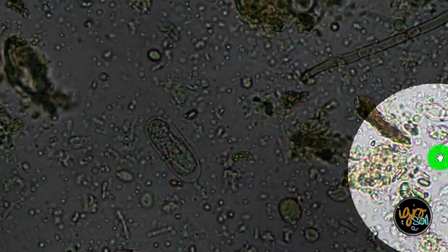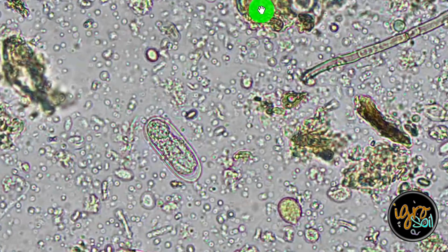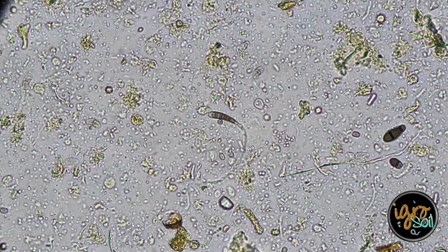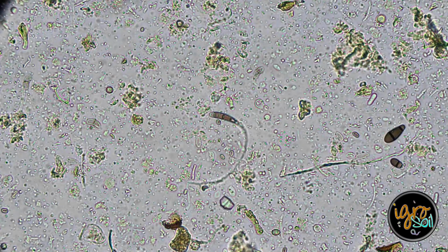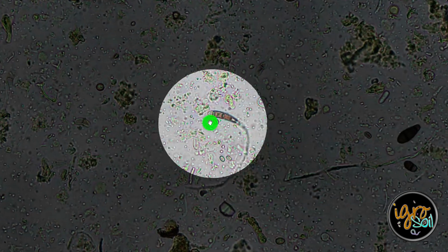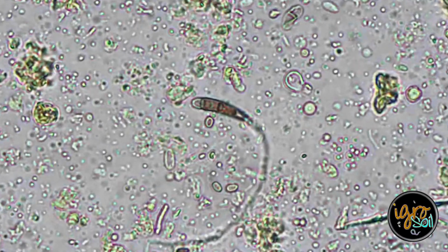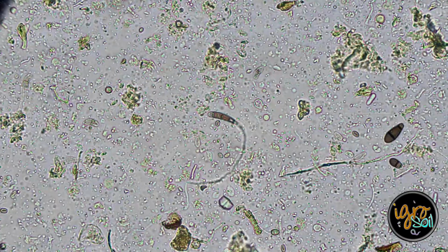And look at all these amoeba and testates and spores, organic matter, bacteria everywhere. Look at this spore. Here's a perfect example of a spore sporulating. Right? Here's your spore. We've been seeing, like, there's a spore there. There's a spore there. There's two of them. But over here, you have the same type of spore that now has opened itself up and it's growing. And it's getting to work. Pretty amazing stuff.